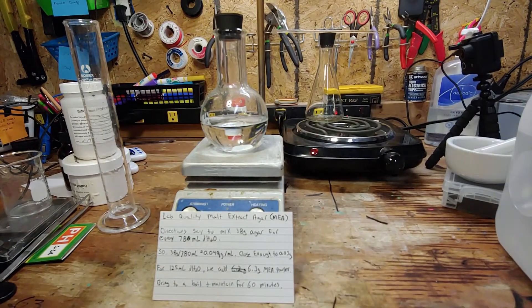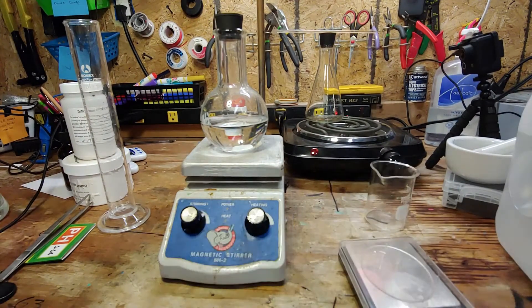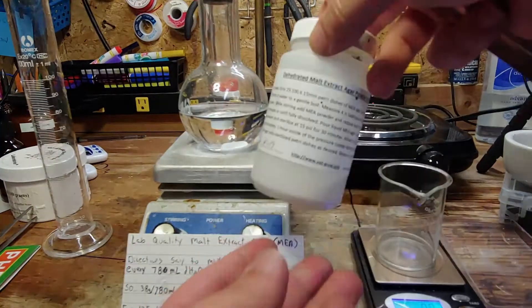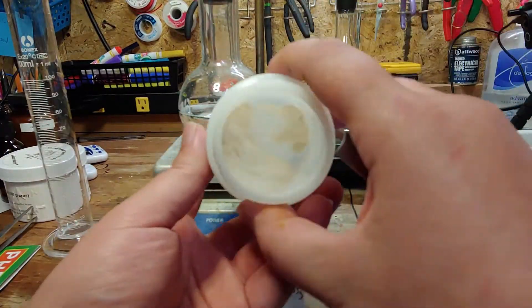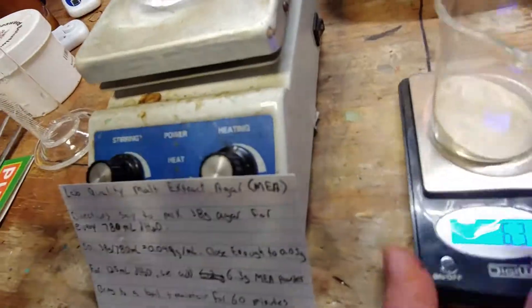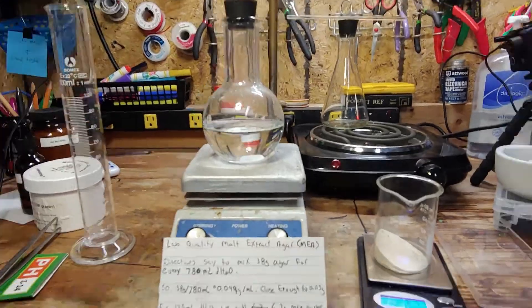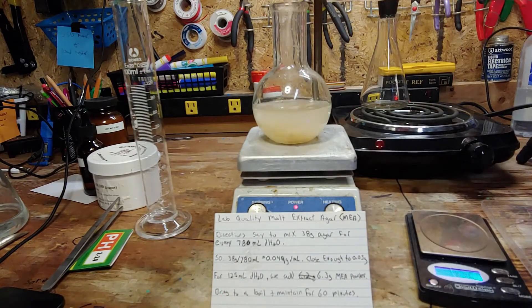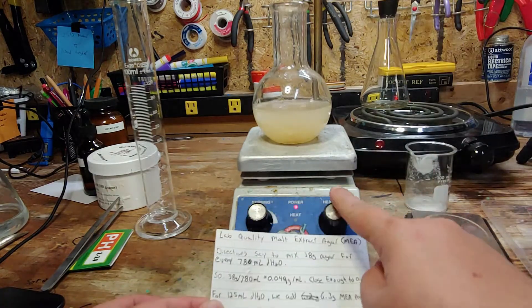Plug the flask opening with a rubber stopper and weigh out 6.3 grams of our lab quality malt extract agar powder. I like using lab quality materials if I want to eliminate as many variables as possible. This first batch and setup will obviously be the more expensive route, but it is very convenient and reliable. Pour the agar powder into the distilled water, but don't turn on heating. Re-stopper and set aside.